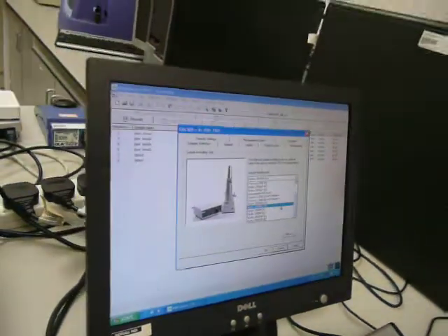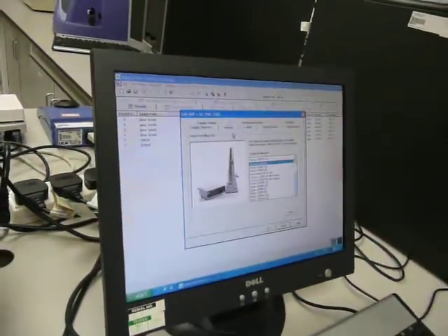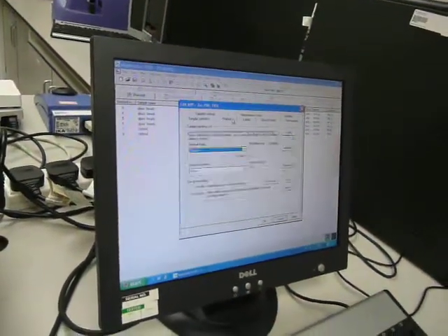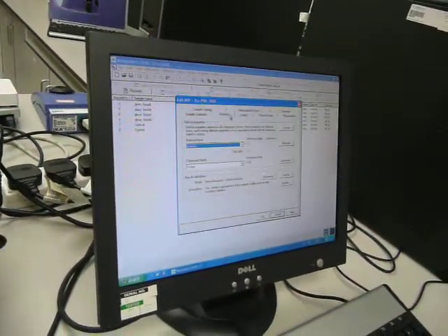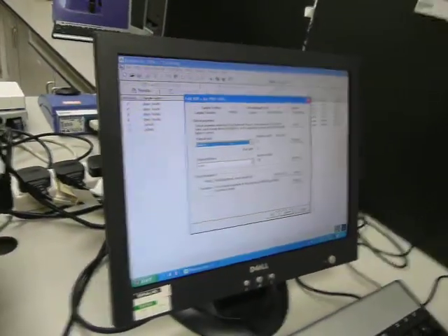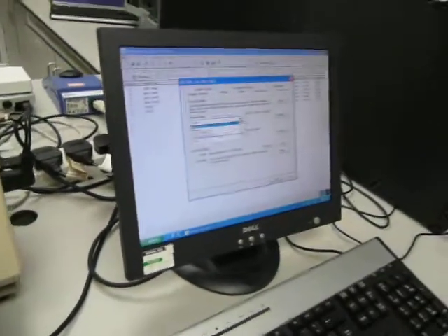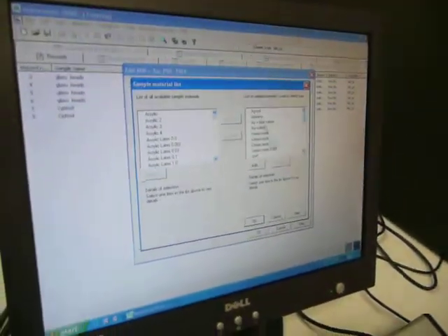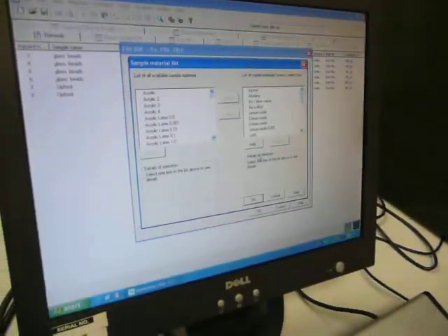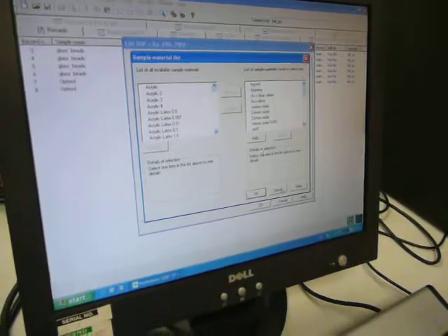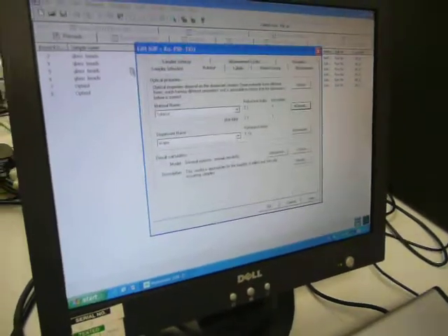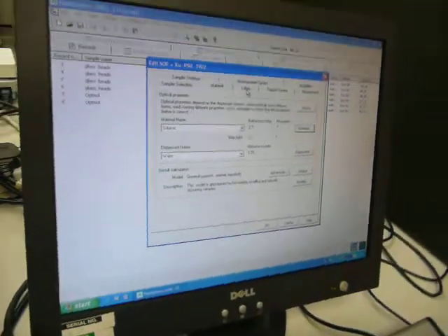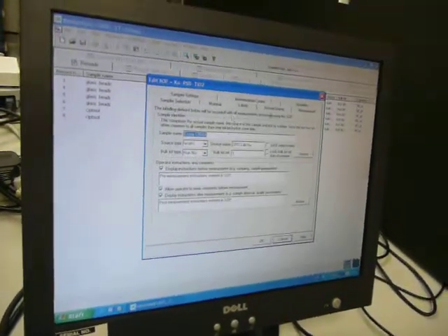SM, that's the solvents. And also from here you select your materials, or you can add your material. But not too much for this relation.